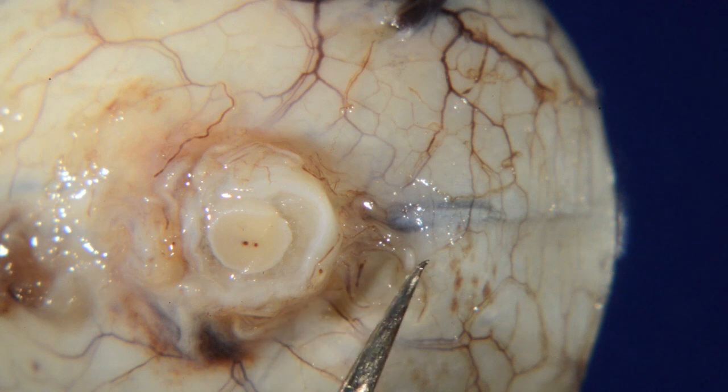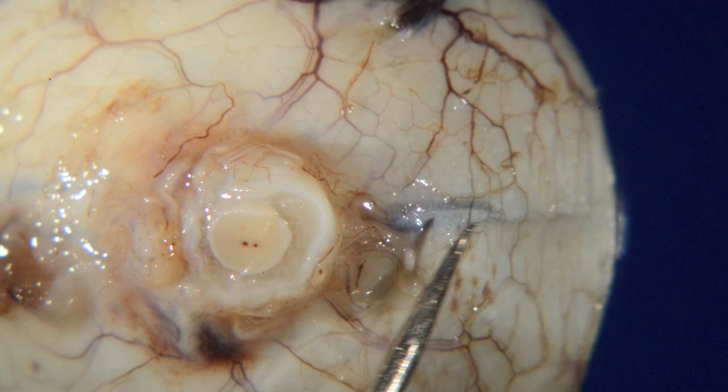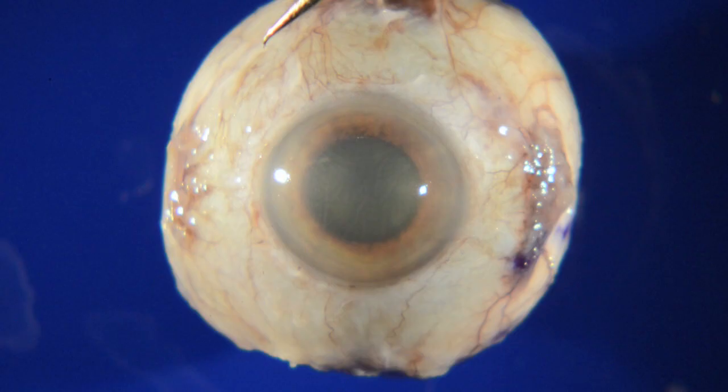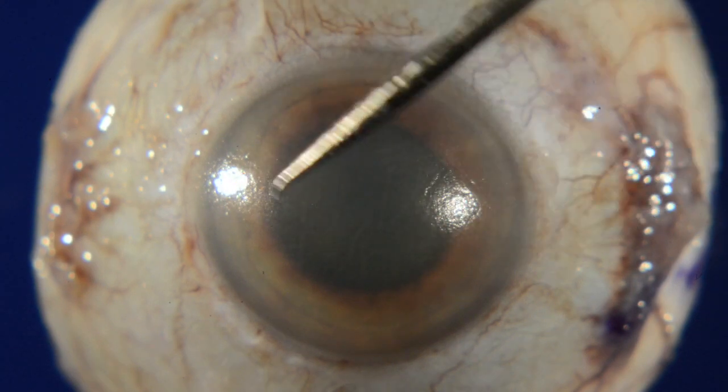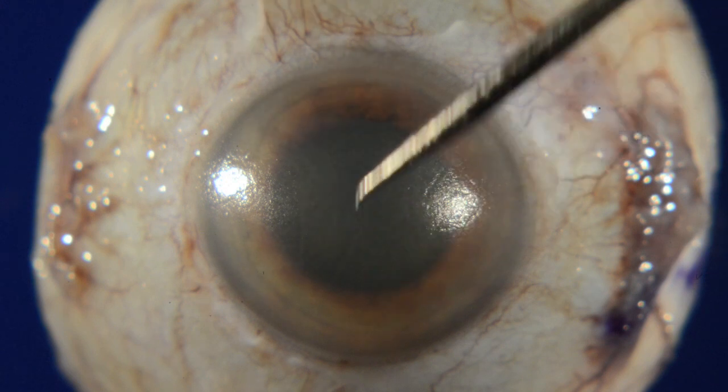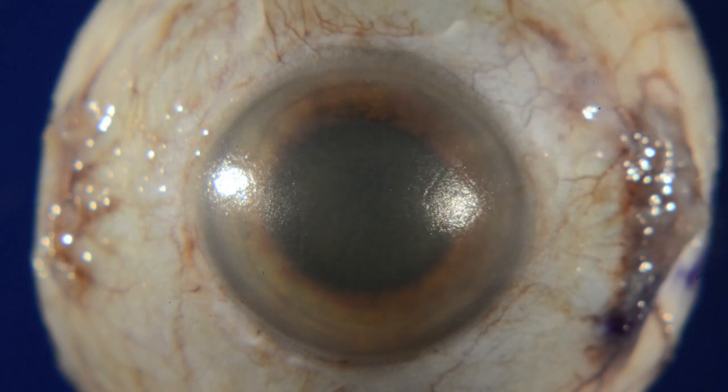The long posterior ciliary arteries are an excellent marker for the horizontal meridian. They are evident as blue lines on either side of the optic nerve. The dimensions of the cornea are another landmark for the horizontal meridian. The horizontal meridian of the cornea is approximately 1 millimeter greater than the vertical meridian. A typical cornea measures 12 by 11 or 11 by 10 millimeters.